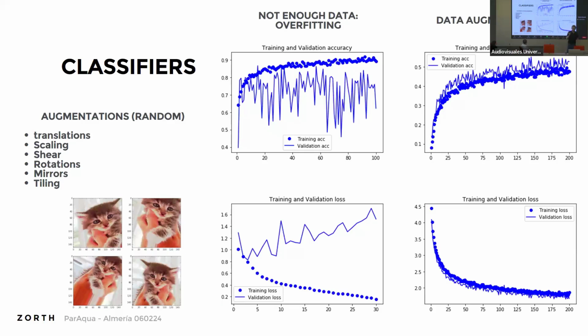Rotations are the easiest. And rotations, you should always have them in biology because you can rotate anything in microscopy. It will come in various orientations. They're good to have. Mirrors as well. That's basically flipping the image like that, and that would correspond in microscopy to flipping it upside down. So they're not bad to have.